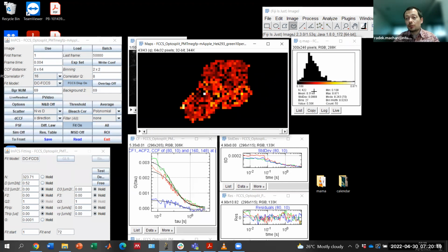Of course, it's much lower than with the 50-50 beam splitter, and it's not so surprising because when working with fluorescent proteins, especially the red fluorescent proteins, can have quite a long maturation times, and not all of them are also in bright state.